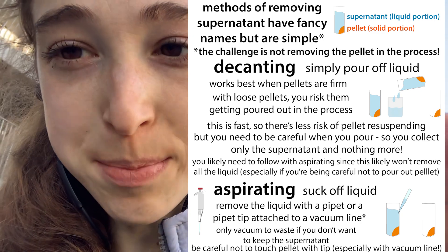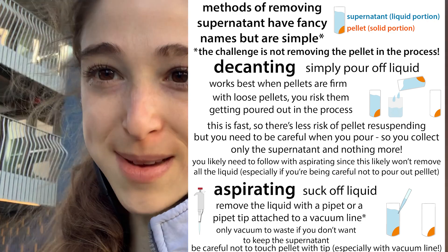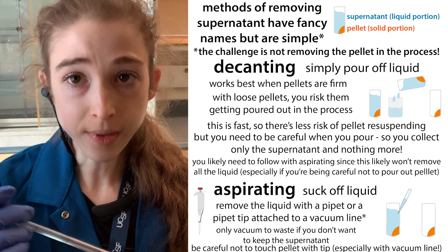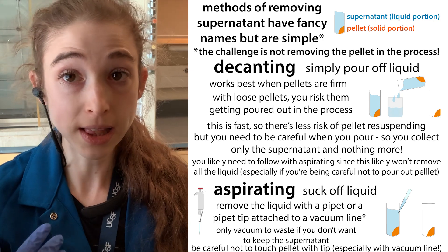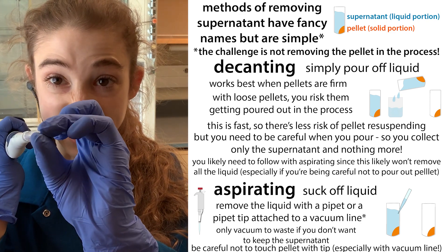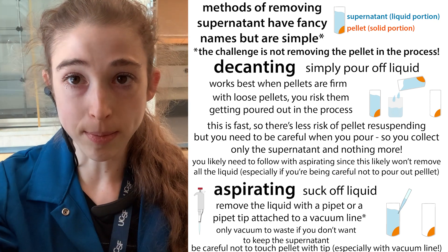When using an aspirating pipette with a vacuum, be really careful not to accidentally touch your pellet with it, because it's going to suck it up. Sometimes you may need to angle it or help the vacuum along. It can also be easier to stick a 1 mL tip on the end of the vacuum line. The basic idea is to remove that liquid as quickly as possible so you don't get resuspension between the pellet and the supernatant. Start with a larger tool to get most of the volume, then switch to a smaller pipette with a finer tip to get the last of the liquid.